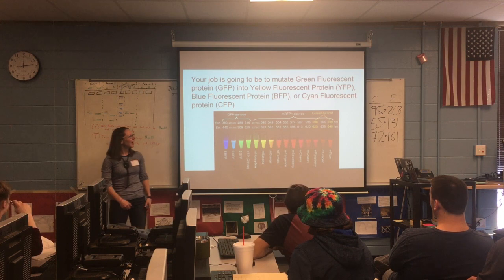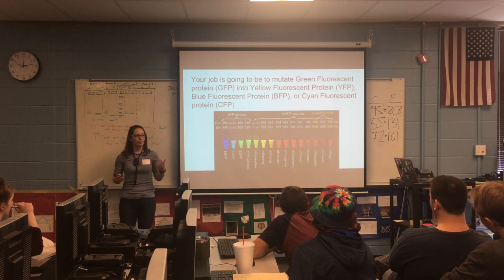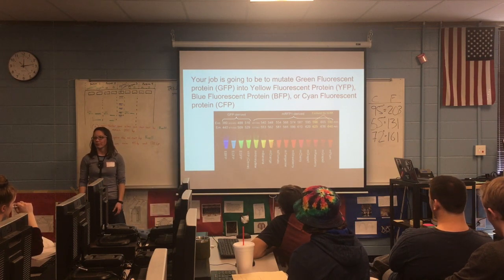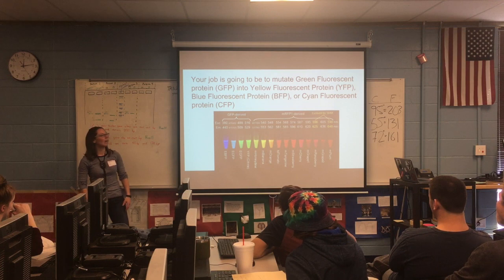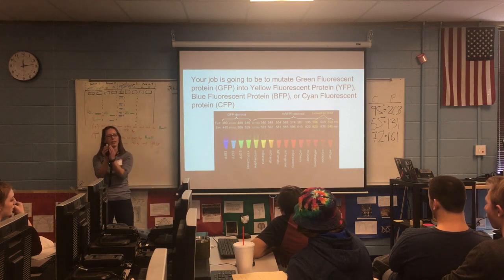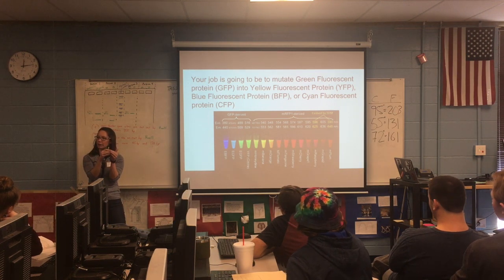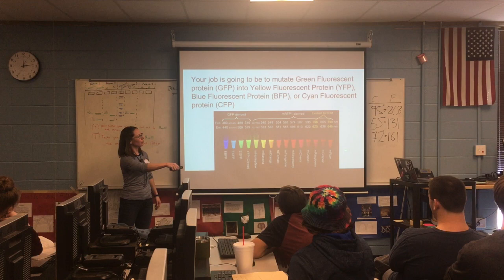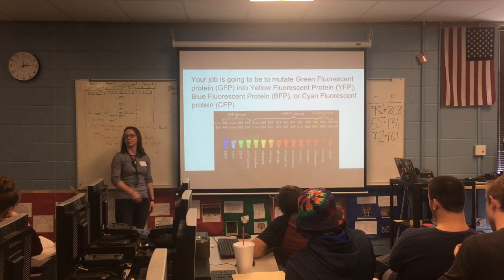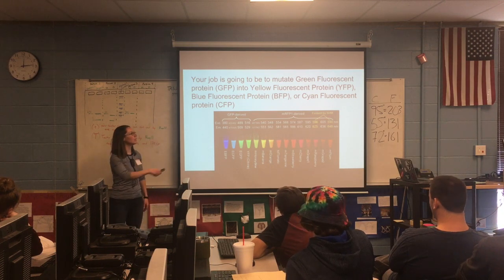So a lot of the colors that we end up getting, we get from more exotic types of animals because those are the ones that naturally fluoresce. So people have kind of gone in. I think RFP was actually two proteins that when they come together make RFP, and they've now found a way to combine those into a single protein and then mutate that into all these other colors. I looked into doing that, that was harder. So we're doing the easy one. Awesome.